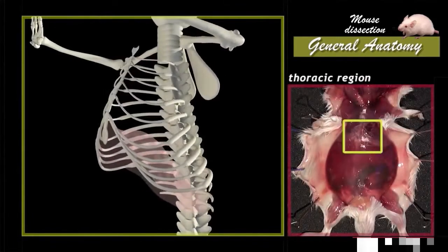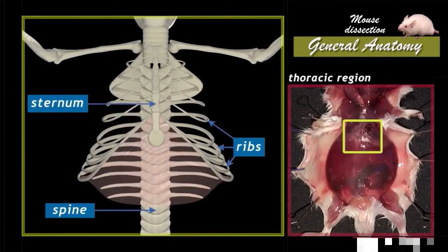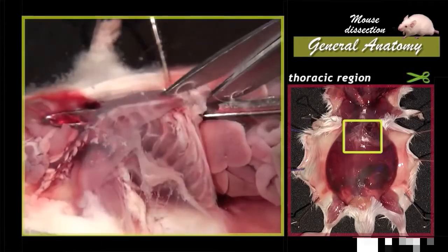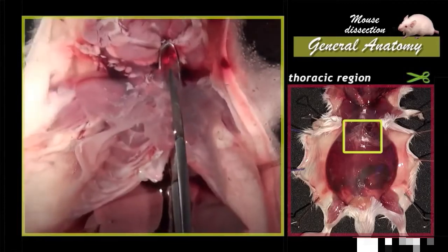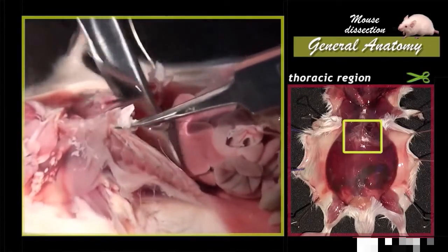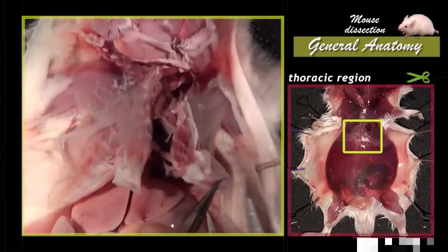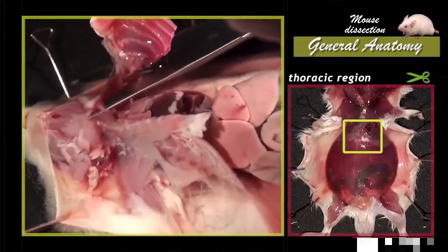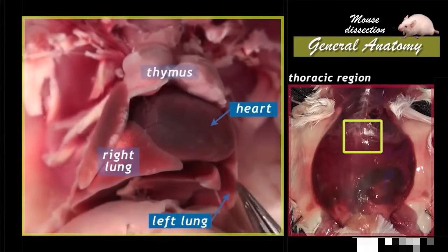The ribcage is dorsally limited by the spine, sideways by the ribs, and ventrally by the sternum. The thorax dissection allows us to observe organs that are in the thoracic cavity. The sternum is cut with scissors following the groove director. The diaphragm is cut at its periphery following the costal arch, and the rib foldings are removed. The lungs, the heart, and the thymus gland are now visible.